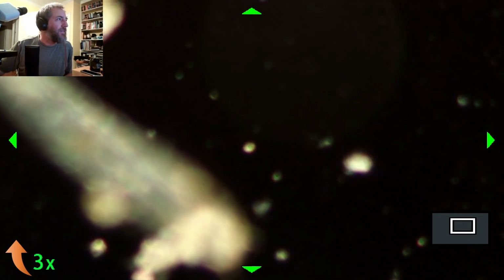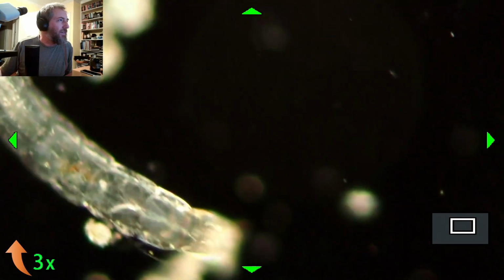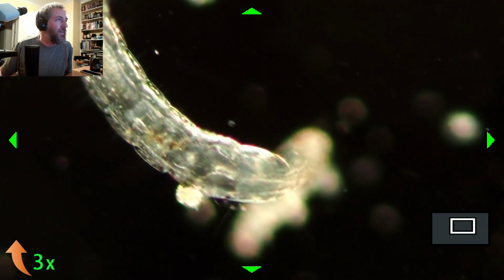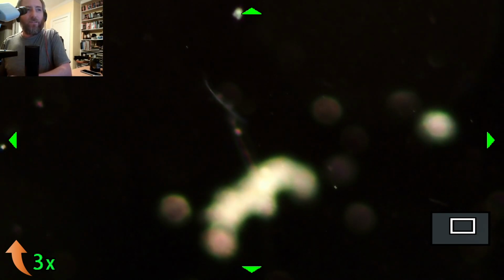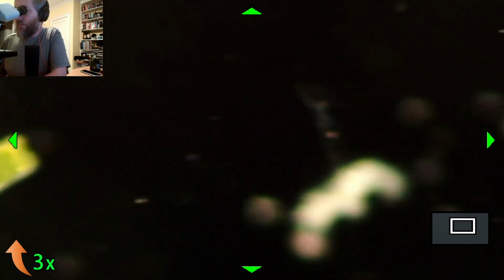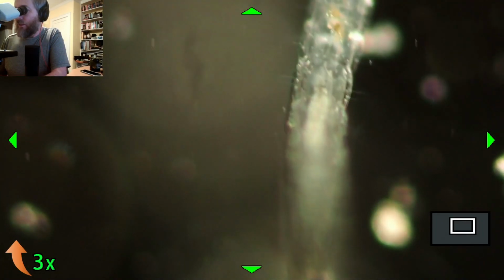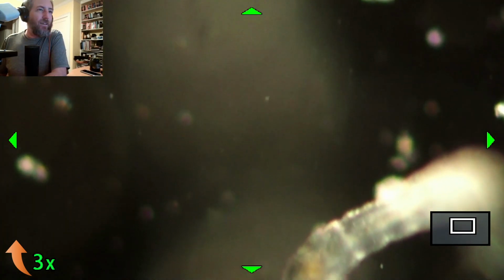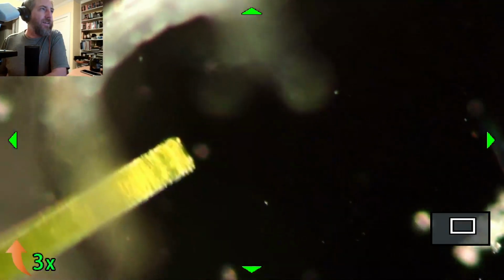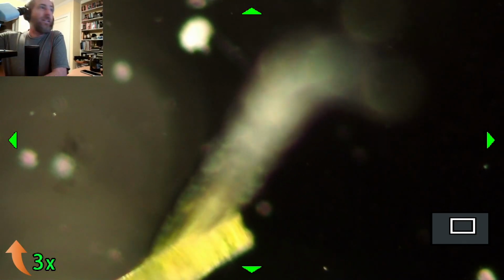Hey, Whisker. Found ourselves a chironomid larva. Wants to show us the backside, I guess. And hello, Evalazi. And one of those little bags. It's super twitchy. Doing a lot of jumping around. Becoming a regular on here, Whiskery. Good thing.